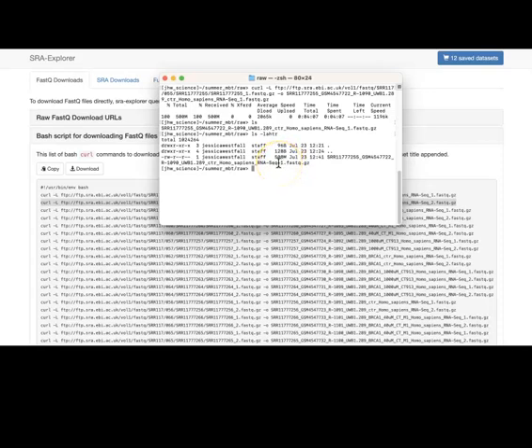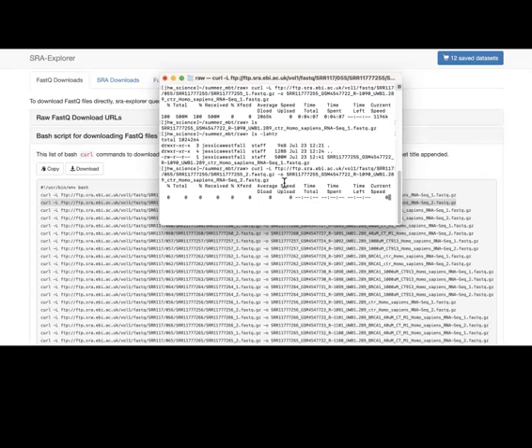So in order to move further with regards to analysis, we need to have both the forward strand and the reverse strand. So we're going to go ahead and repeat this for the complementary pair file. So this is _2. Perfect. So I'll go ahead and just let it run like this in the background. But we will need both of these files for our future analysis. So go ahead and download one of the samples, but make sure you capture both the _1 and the _2.